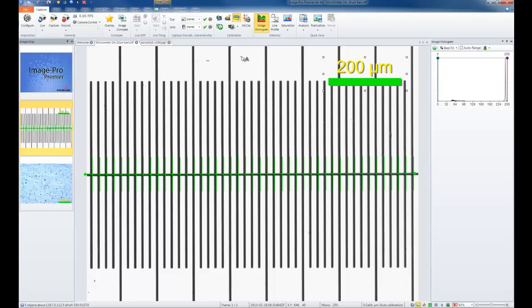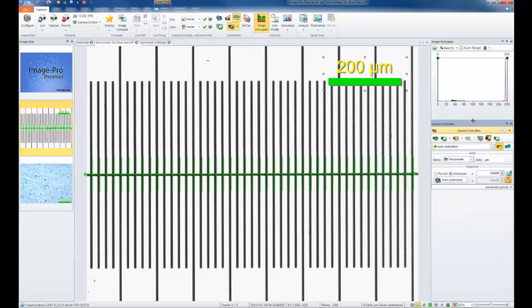To see where my calibration has been placed, I can always go to the spatial calibration options. In this drop-down, my first option opens a dialog which gives me many different options to choose from. In here, we see all the calibrations that have been created as reference calibrations. Small icons denote the type of calibrations that have been created as well. The star shows all my reference calibrations, and the globe shows my system calibration, the one that will be applied when I capture with a camera.